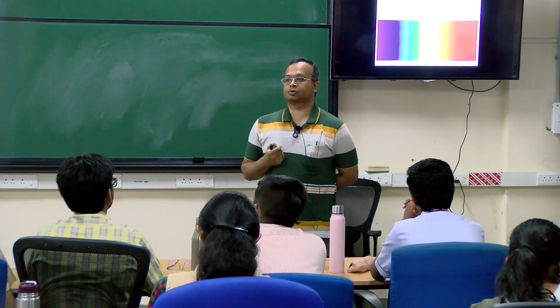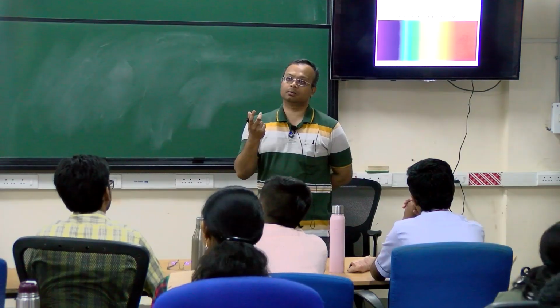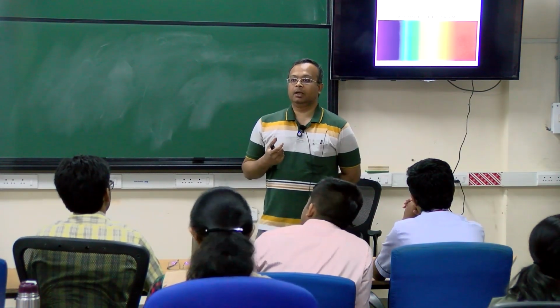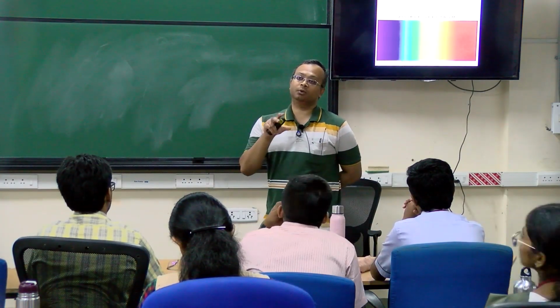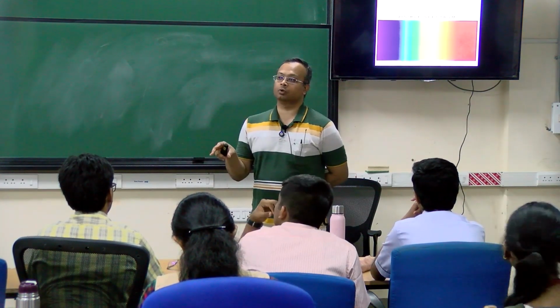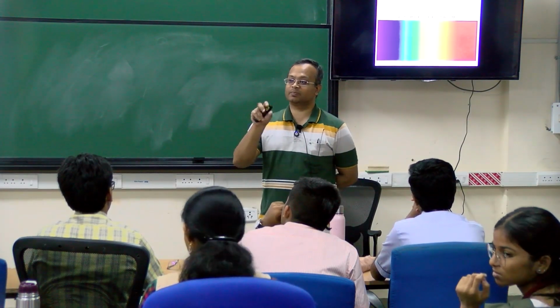it will be used for microscopy. He just wanted to know what is causing the jellyfish to glow. Okay, but what people after him did was that if we combine the concept of fluorescence with microscopy, then we can label things with specific colors.